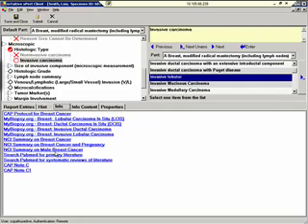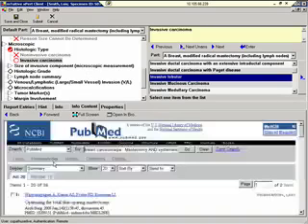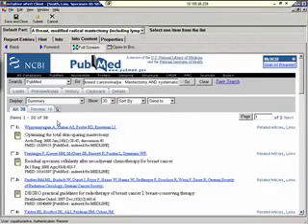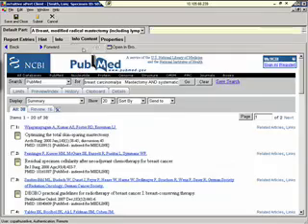We'll click on Info and we'll click on Search PubMed. What the system has done is it's gone out to the PubMed website and performed a contextual search. In other words, it has just retrieved information that is applicable to the case you're working on. There are only 38 cases out of all the available cases on PubMed that apply.